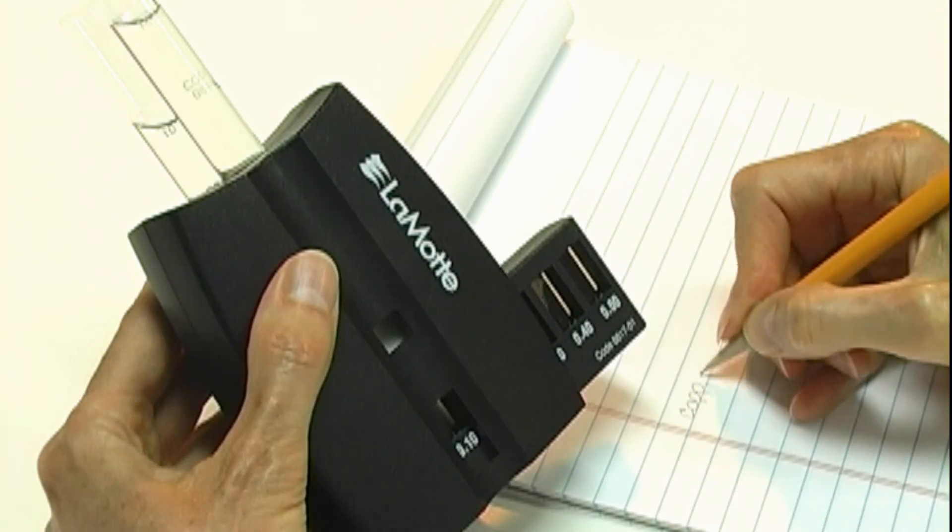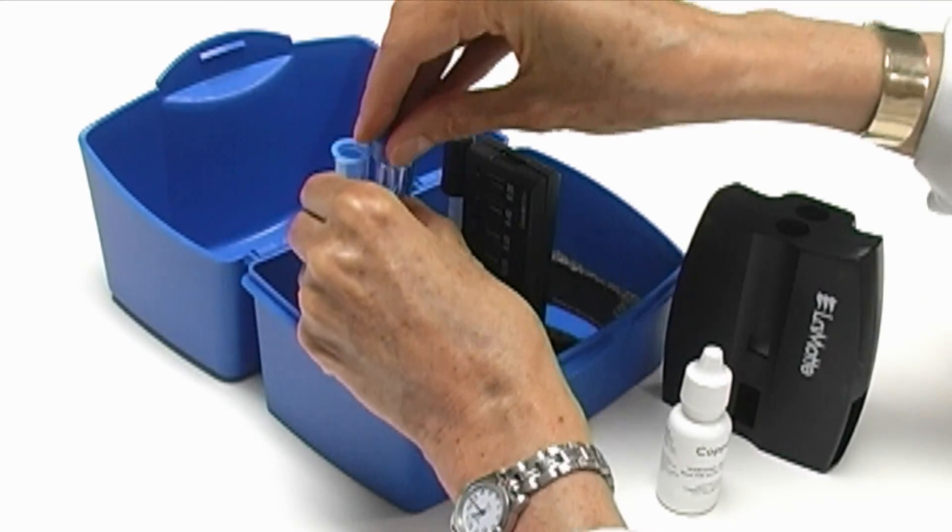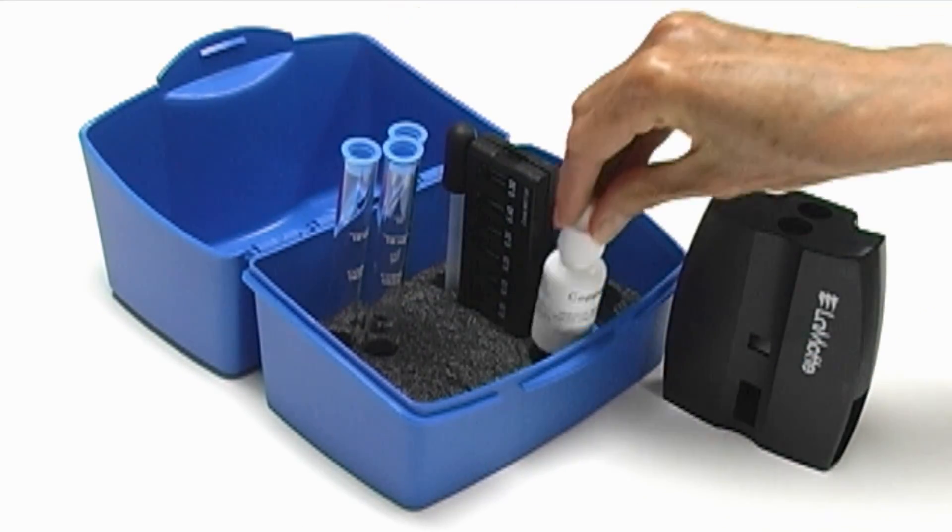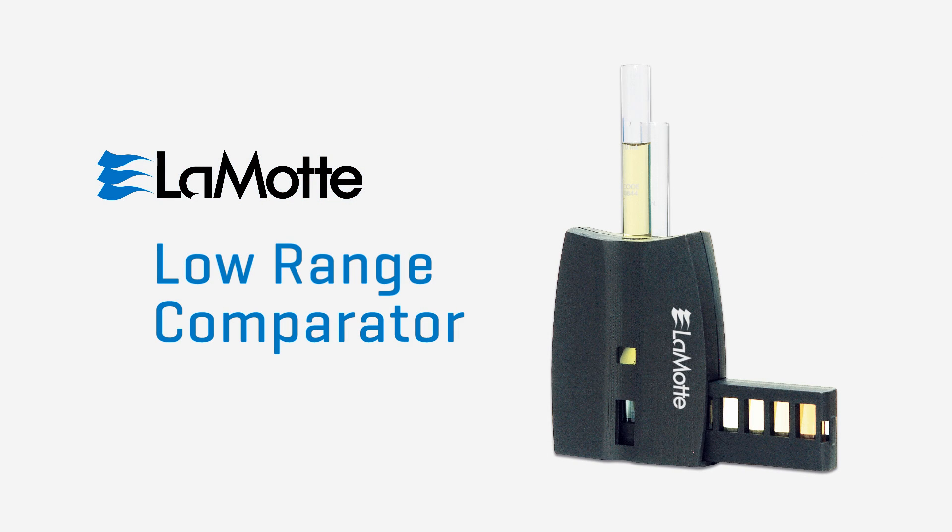Record the test result. Clean and dry the glassware and replace the items in the kit. Thanks for choosing a LaMotte Company low range comparator kit.